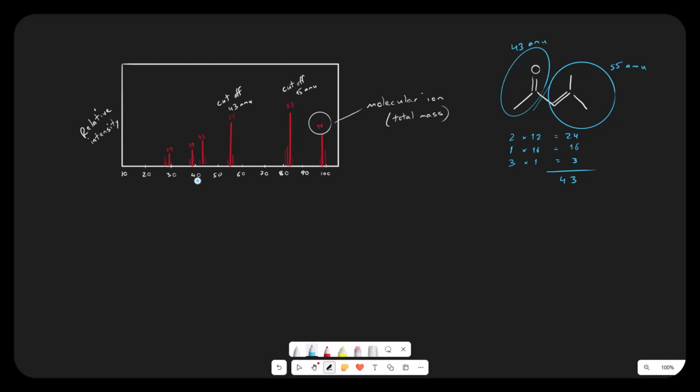Mass spectrometry on its own is probably not going to give me the whole picture. I might need some IR or UV vis or something else to go with it. But mass spectrometry is going to give me a reasonable idea of some of the chunks that I cut off. If I'm doing this in a chem lab, then it's probably to verify a synthesis. I'm looking at the different molecules that I could have made given my reagents and using this to confirm which of those I actually made.